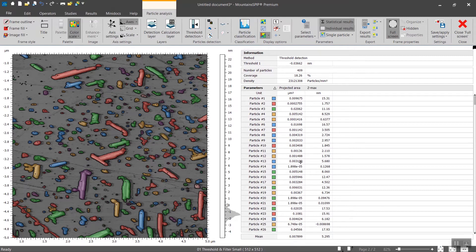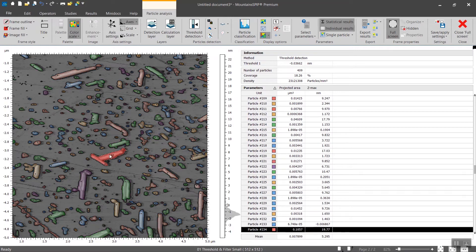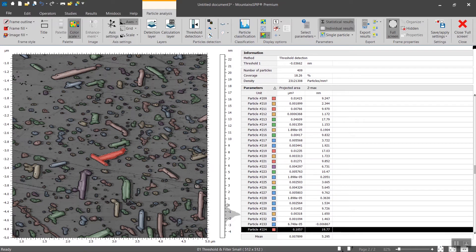There is interactivity between the two. For instance, if I select this particle here it will show you its ID number on the table and then you will be able to read the values of the projected area for instance.